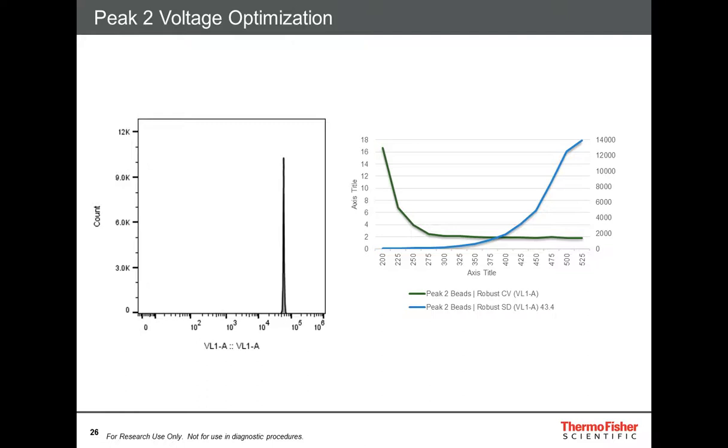That way, if my instrument changes, if anything changes in my experiment, I can say to the FDA or to the reviewer of a paper that I have measured the same fluorescence every day. So this is a great way to not only make sure that your instrument is characterized, but make sure that you are characterizing your experiment as well.